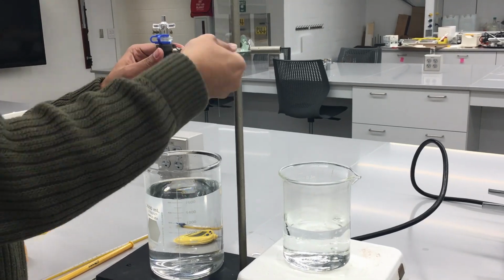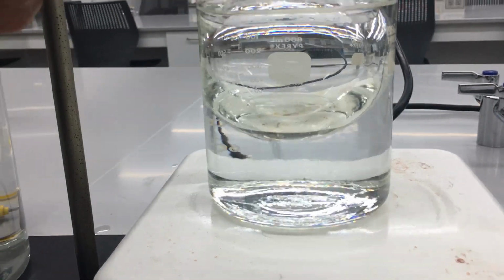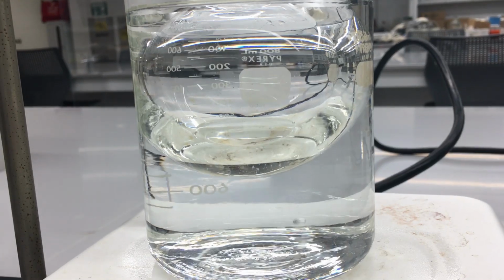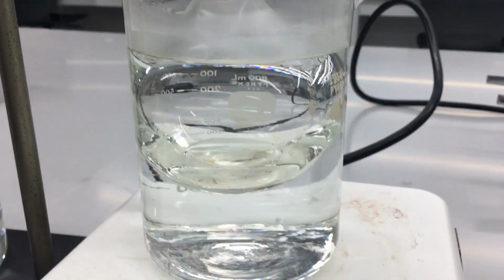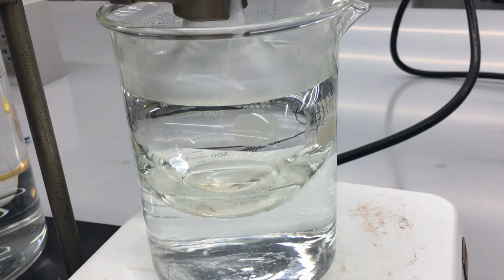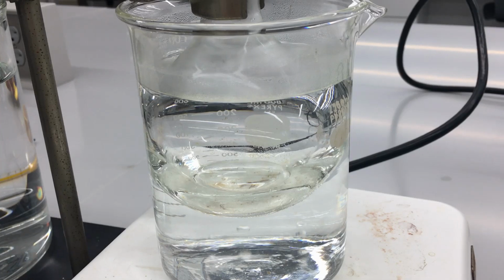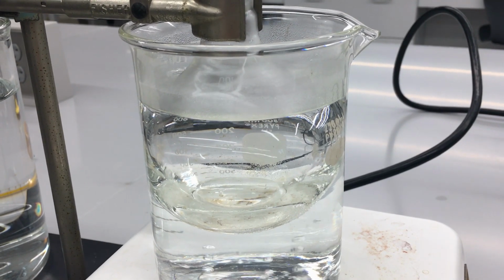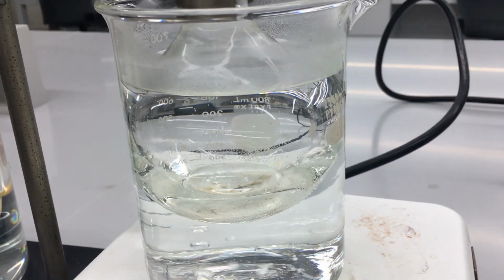Go ahead and place that inside of our round bottom flask, and submerge that in the boiling water bath. So now we can vaporize this liquid and do the same thing we did, but this time for trial 2.